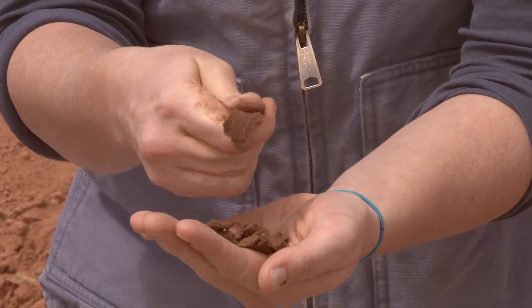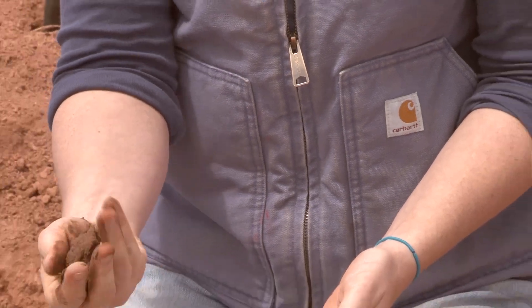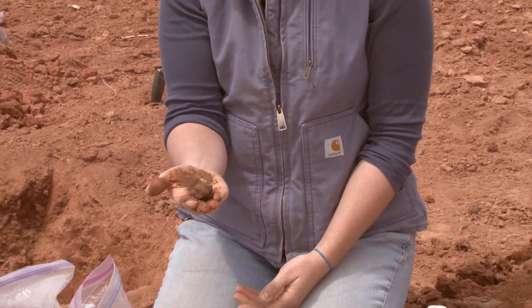It's not going to have much silt or clay in it whatsoever, but it has just enough that it does form a ball that holds together when I give it an impact. So this is a loamy sand texture.